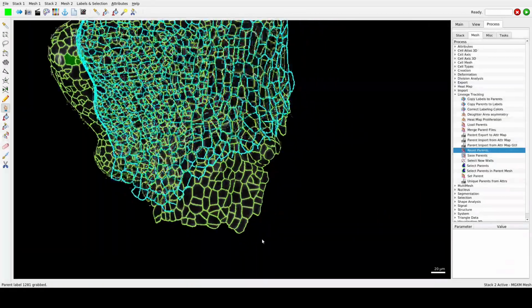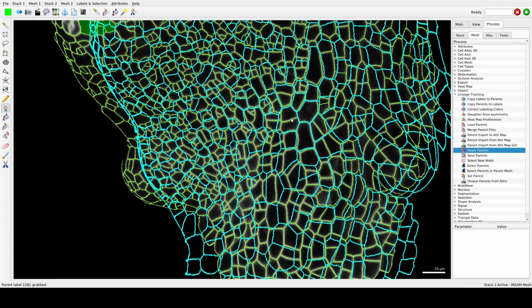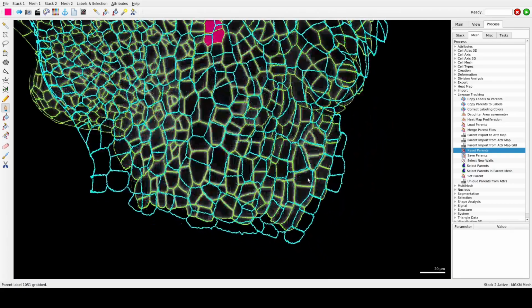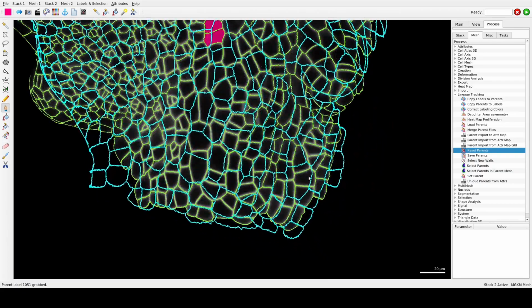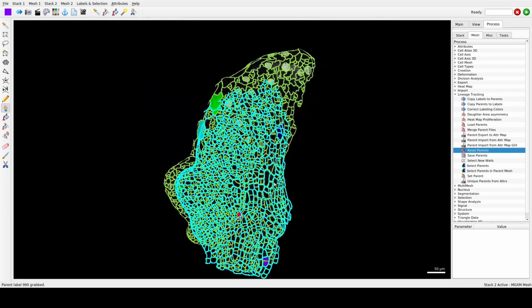And something here as well. Say something like this one. And this one here. Okay.